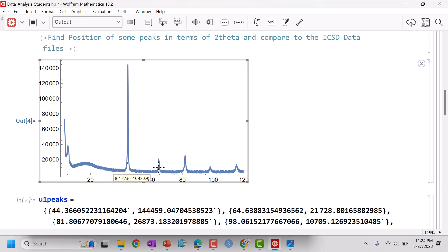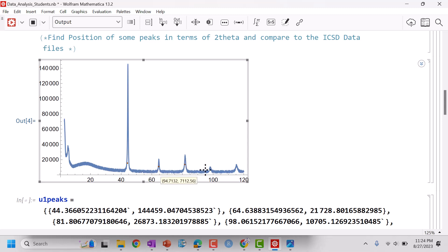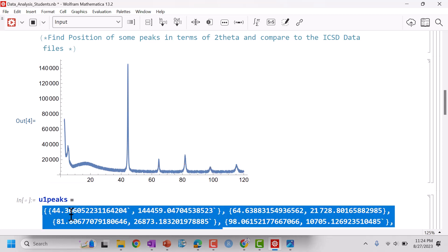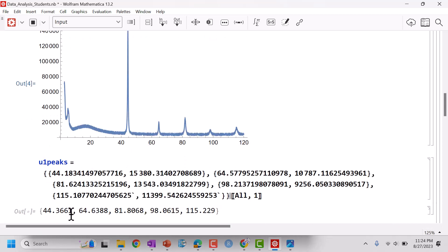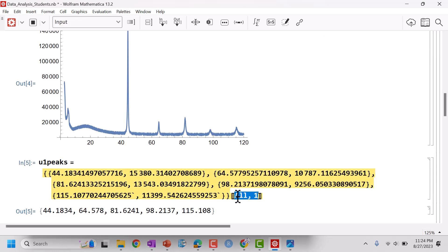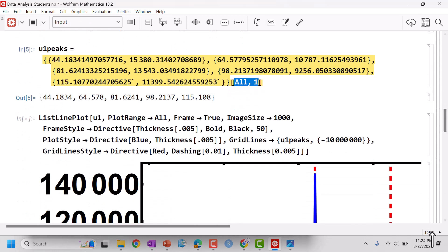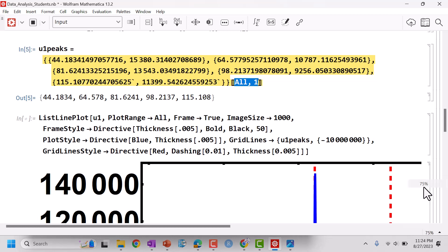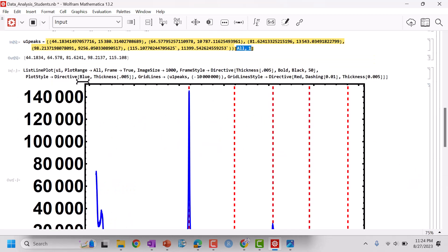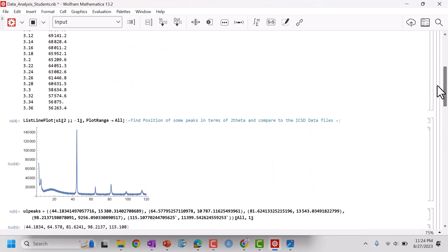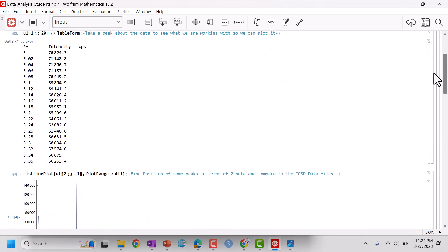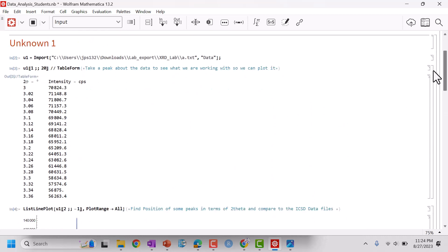I see there's a peak here, there's a peak here. You want to be pretty accurate here. I'm doing this quickly just to be quick. I'm going to click straight in the center of the peak. Again, center in terms of where the peak actually occurs. Click it here, click it here. I can do control C and I can paste basically where the locations of those peaks are. You'll see why we're doing this in a second. I'm just grabbing the X coordinate so I don't care about the Y. Well I care about the Y philosophically but not—bad joke.